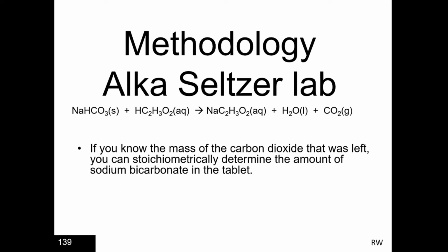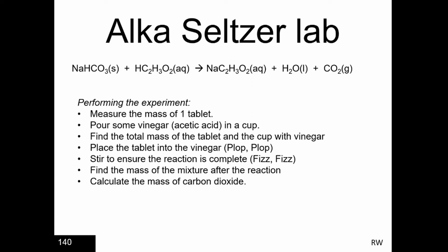So if you took an Alka Seltzer and you put it in the acetic acid and reacted it, how could you know the mass of anything? Here's a procedure to get you started.